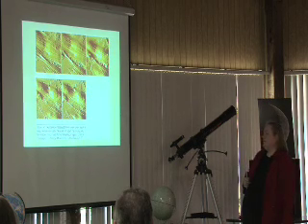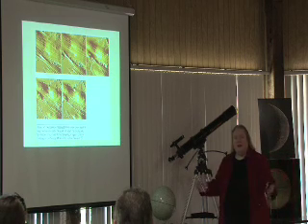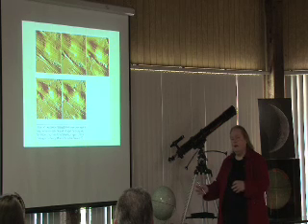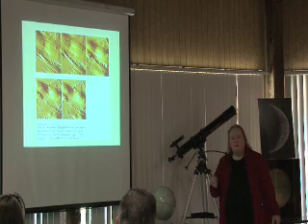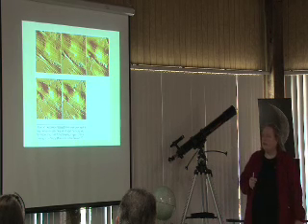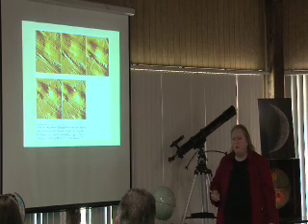All right, these are cells, endothelial cells. Cells are big. Cells are usually on the order of at least tens to hundreds of microns. So sometimes you're looking at cells, you're looking at 10 microns or so. But AFMs can be designed to look at micron-sized things pretty well too. You can see fine structural details you cannot see with an optical microscope.